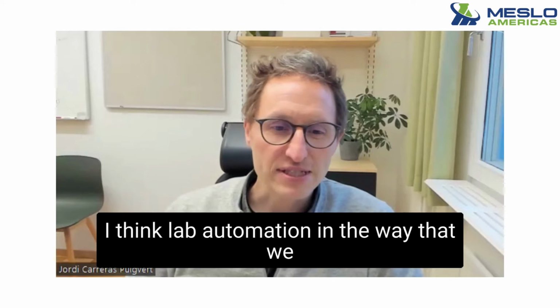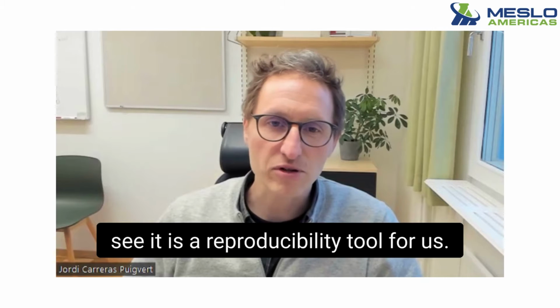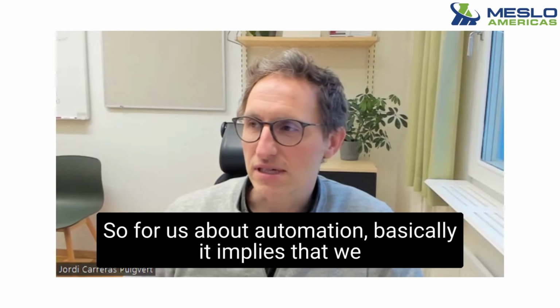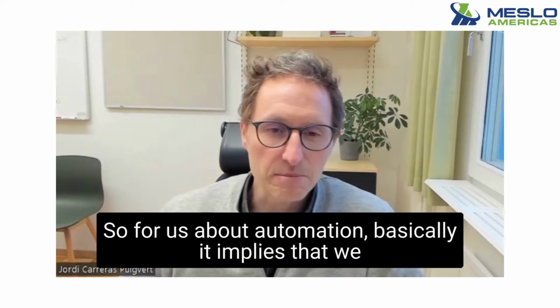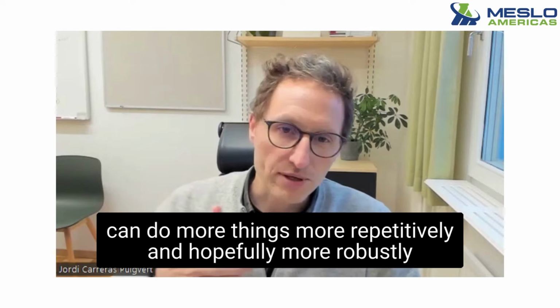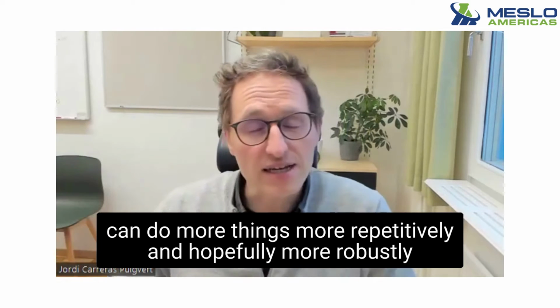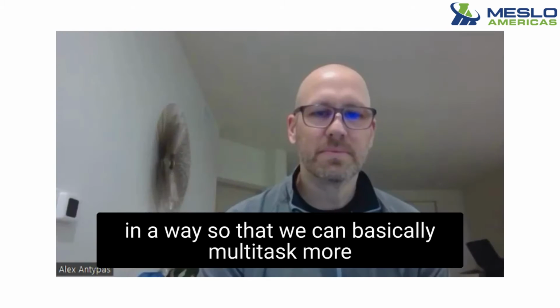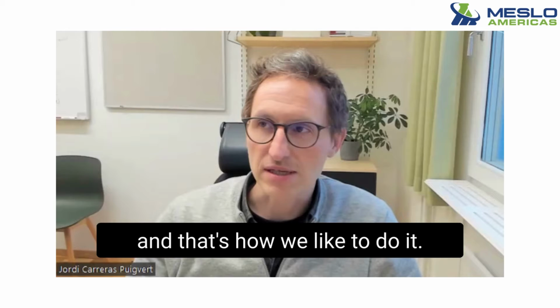That's a good question. I think that lab automation, in the way that we see it, is a reproducibility tool for us. Basically it implies that we can do more things more repetitively, and hopefully more robustly, so that we can basically multitask more. And that's how we like to do it.